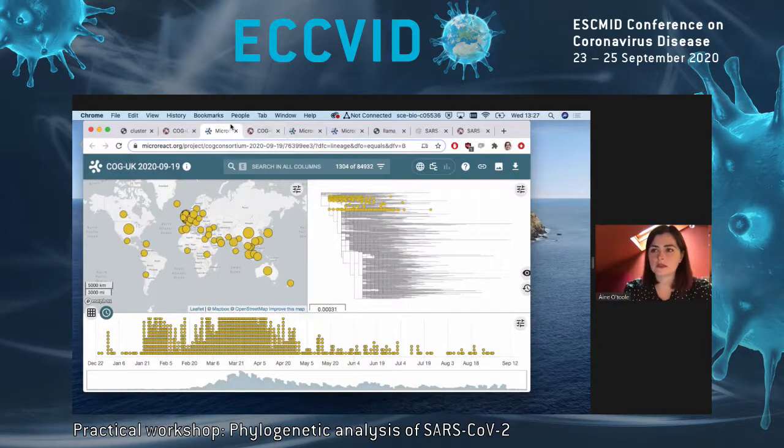And if we open up this one, it's going to have loaded now. So this is the other lineage that are in our samples. And we can see this is much more geographically widespread, many different samples that have been sequenced that are lineage B, because it is one of the basal lineages. And you can see here where it lies in the global tree.